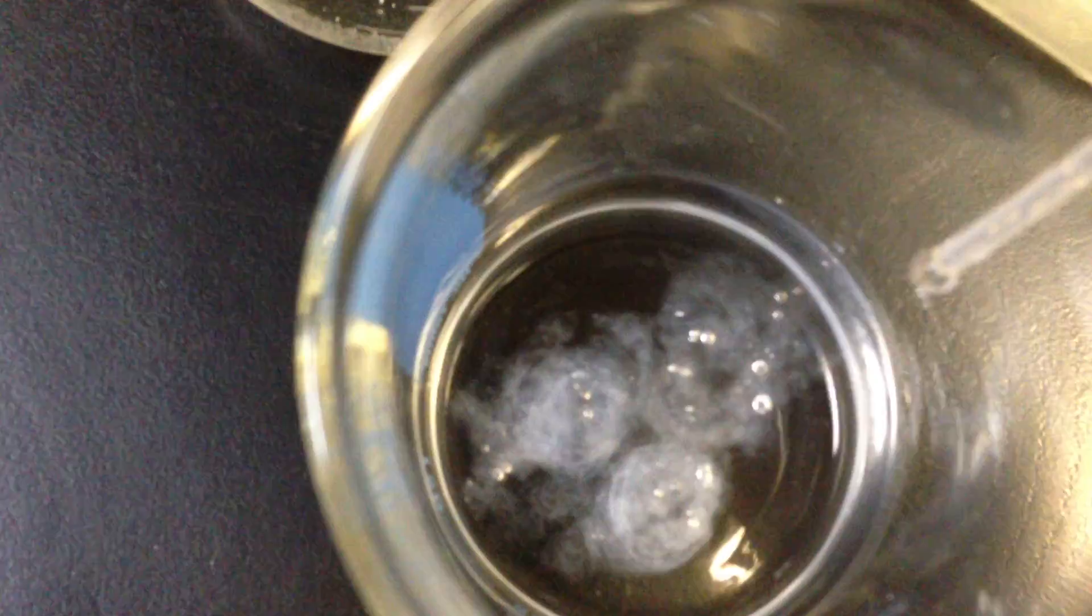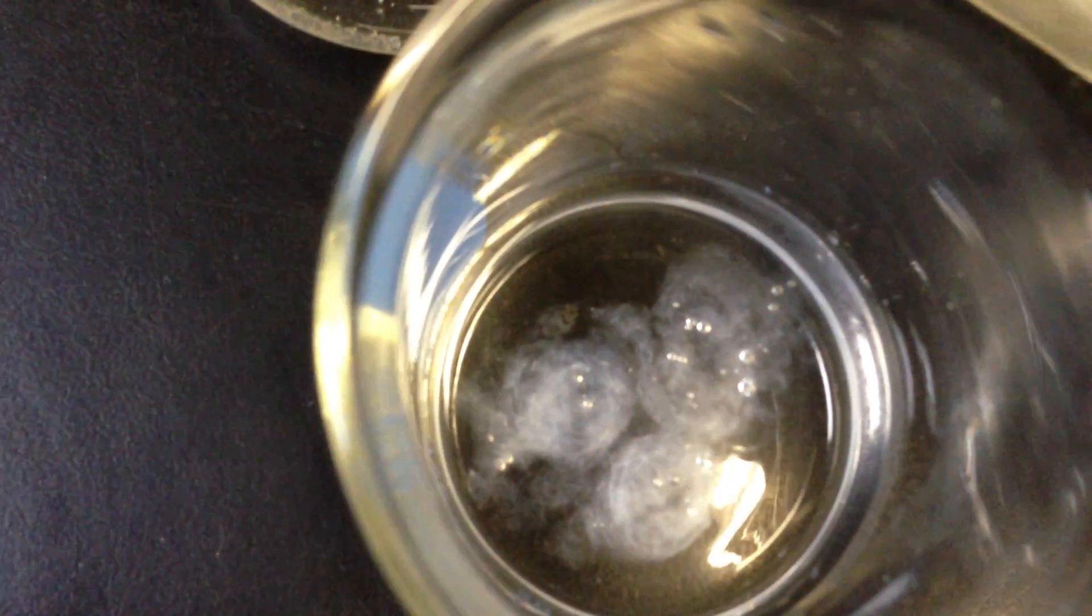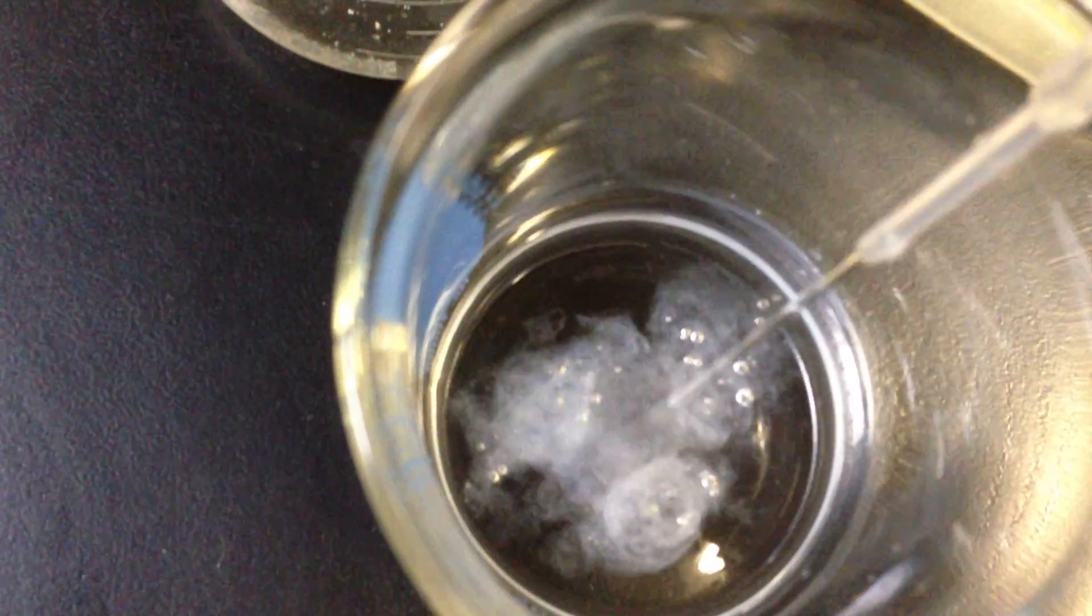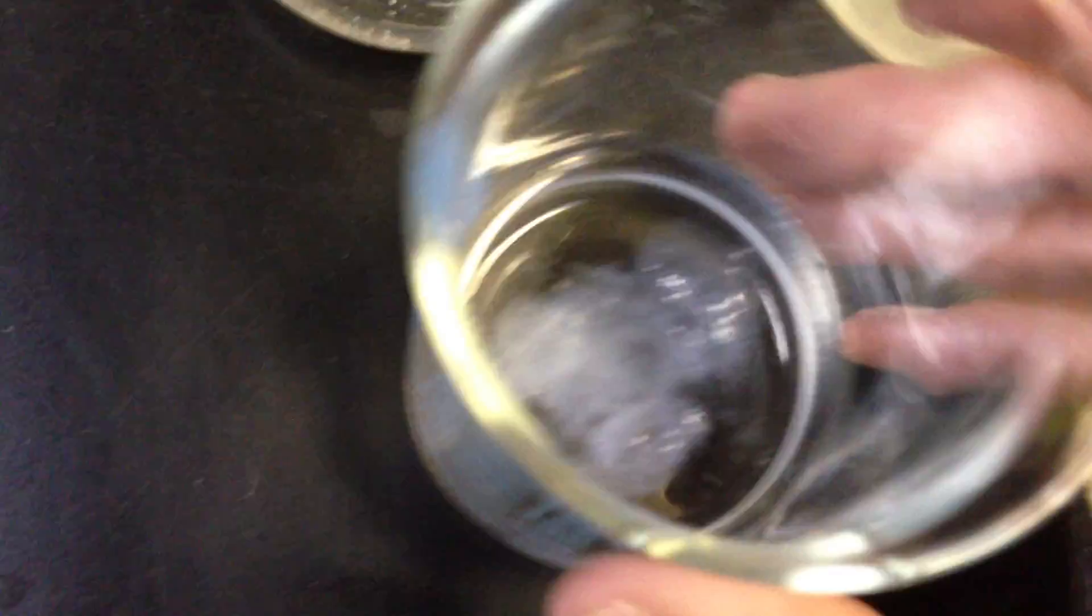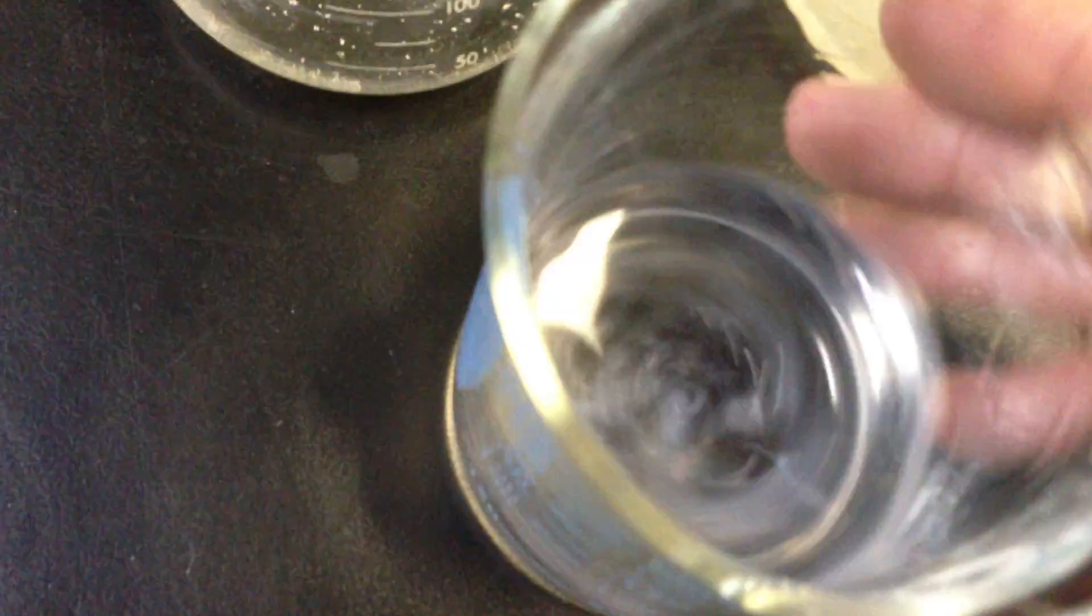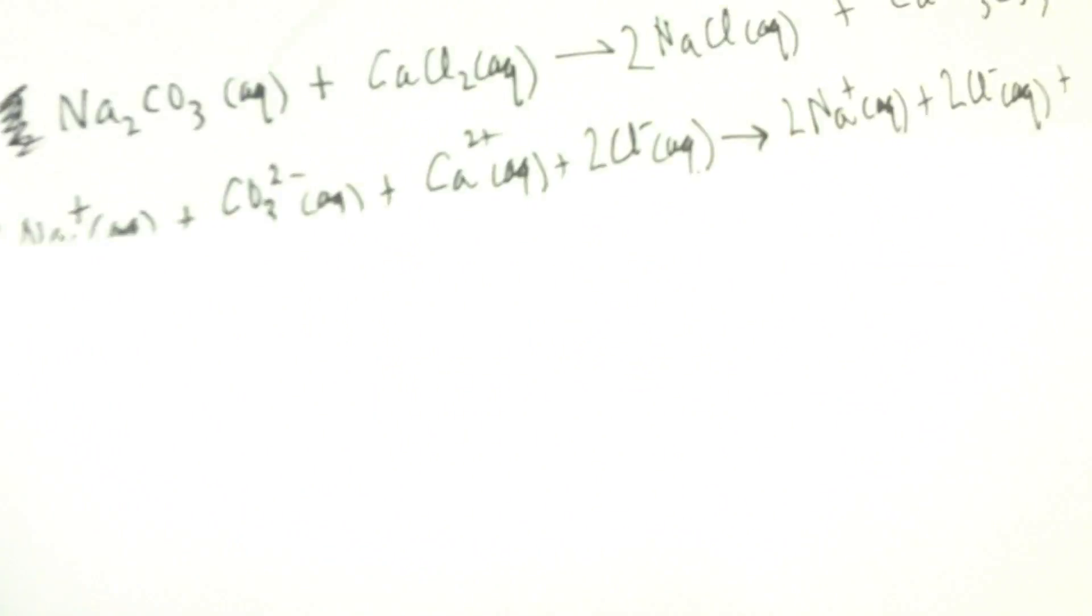Let's take a look. We'll put some more in there. And now we'll go from up above, and you can see the nice precipitate that's formed. And that precipitate is my calcium carbonate. Now calcium carbonate, of course, is just chalk dust. So if I swirl that around, I'll let that settle out for a while, and you'd end up with a white, powdery layer on the bottom. And then, of course, the aqueous layer up above.